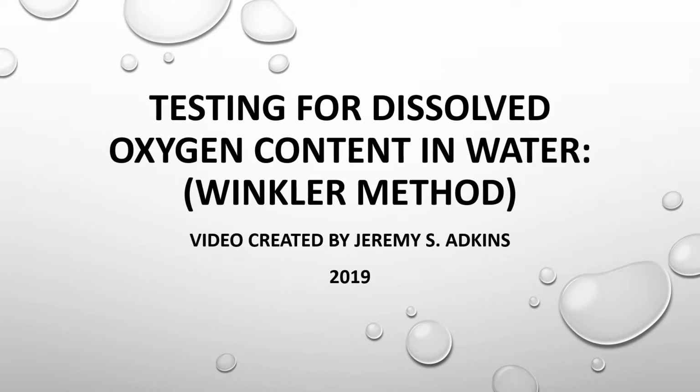My name is Jeremy Adkins, and this is an instructional video on testing for dissolved oxygen content in water using the Winkler method.